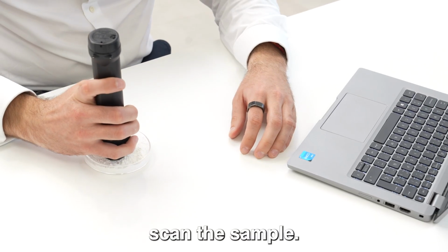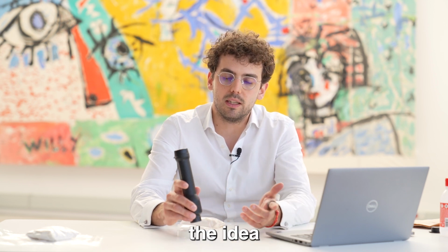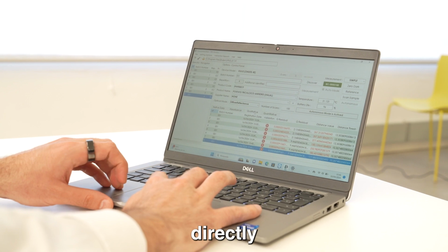You really simply scan the sample. In this case, I'm using a portable instrument. You could also be using a desktop instrument, and you'll have a different range of performance. But simply, the idea is the same. You either scan the sample manually or place the sample on the instrument. Normally, laboratories might use a desktop instrument. And the software directly will give you a prediction.